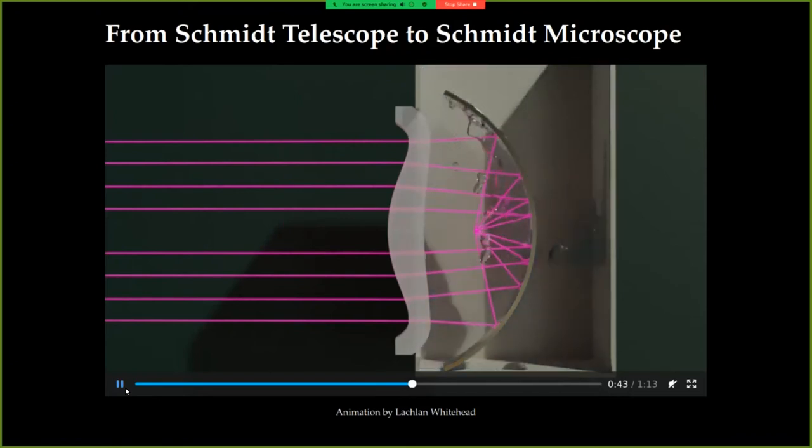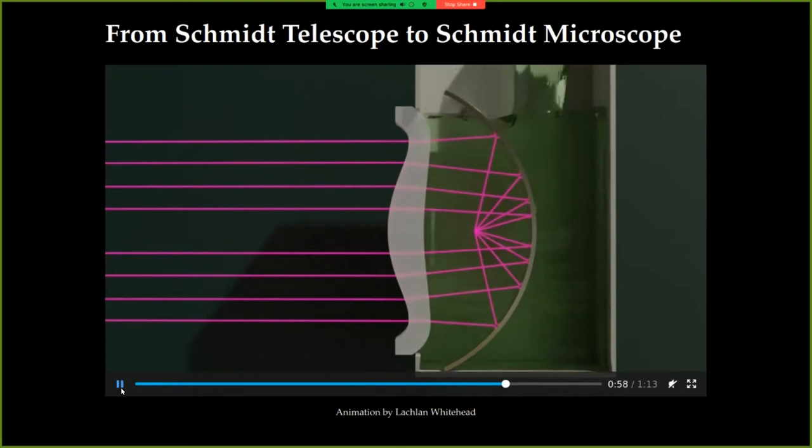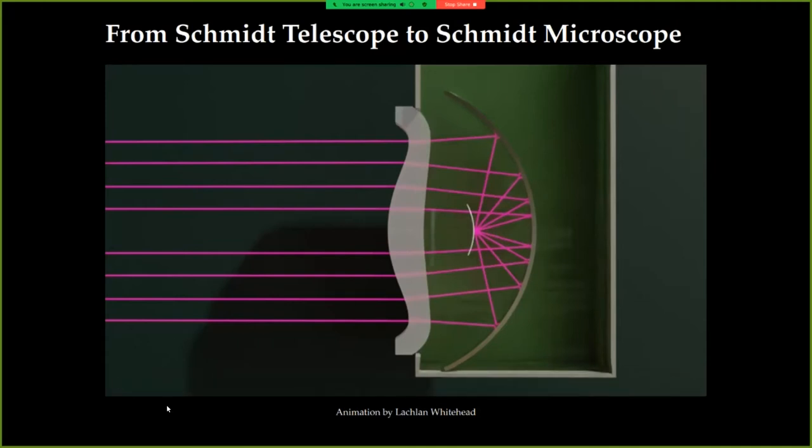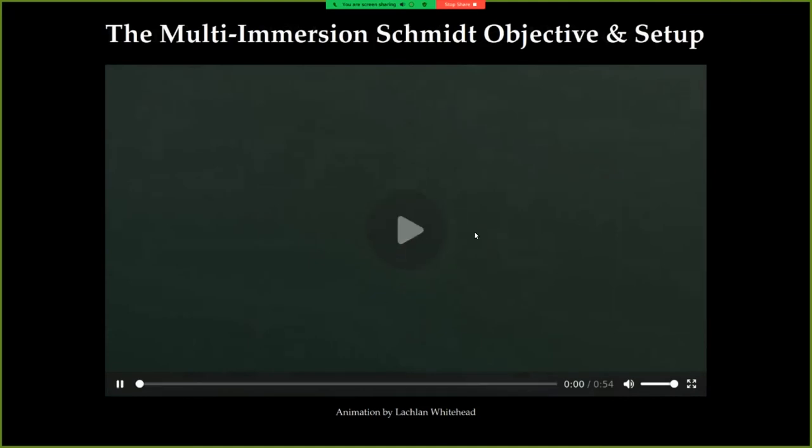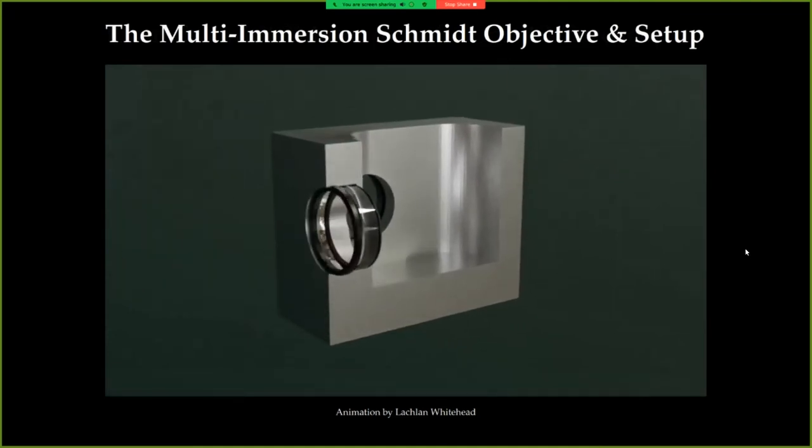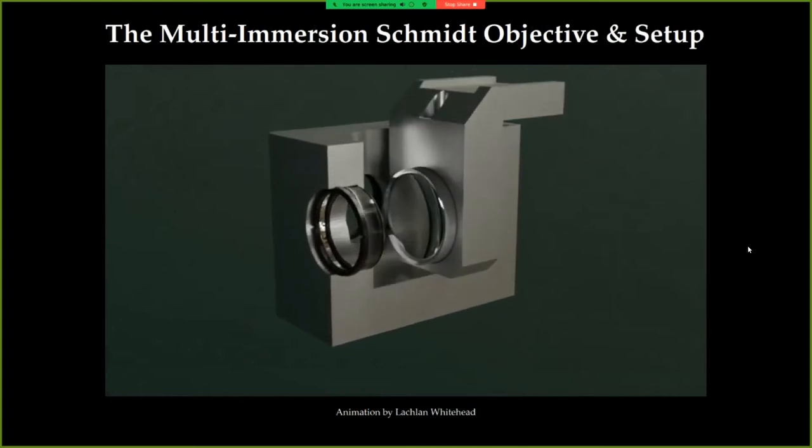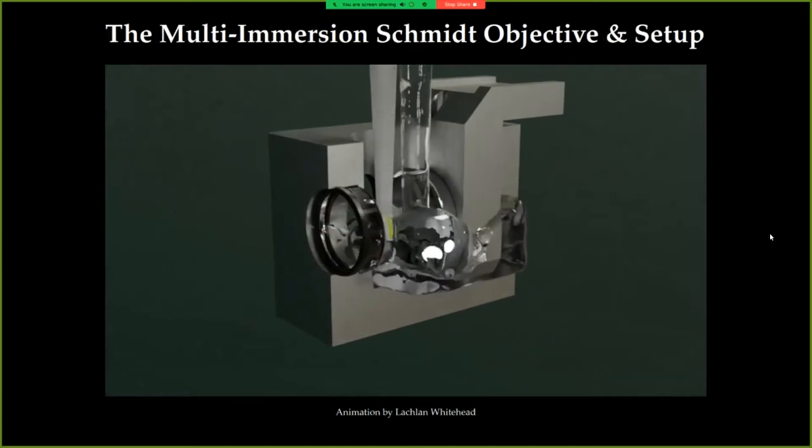And this is what you're going to see here. So this way, we recover ideally diffraction limited imaging conditions, and also over a large field of view. And this works in air. And we can also fill the system with a completely different immersion liquid. And we will still have basically the same ray path, and thus we will still retain very good image quality. Similarly to a Schmidt telescope, the focal surface of such a design is curved. And so we can have a curved surface in here. And this is what the concept of the microscope looks like. And the real thing that we've put together actually looks a bit more like this. So we take a correction plate, we take a mirror, and then we put everything in a chamber. We put a sample in between, ideally a cleared sample. And then we fill this chamber with an immersion liquid.